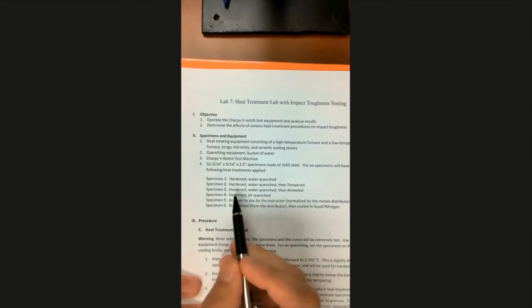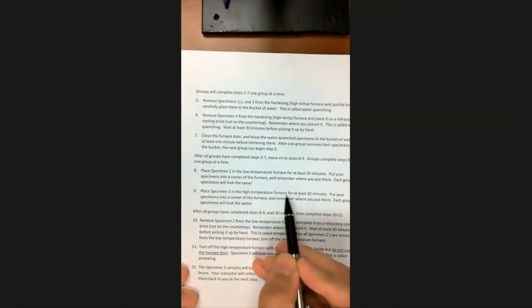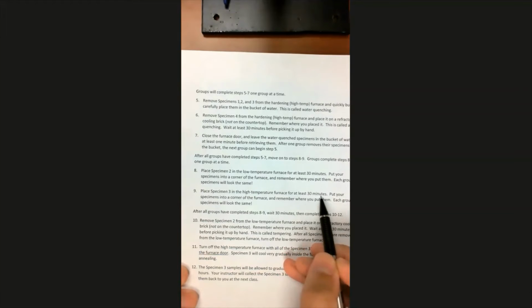Specimen 3, what are we going to do with specimen 3? It's going to be annealed. All right, so remember what the annealing process entails. We're going to take and put it back into the high temperature furnace and leave it there for at least 30 minutes.